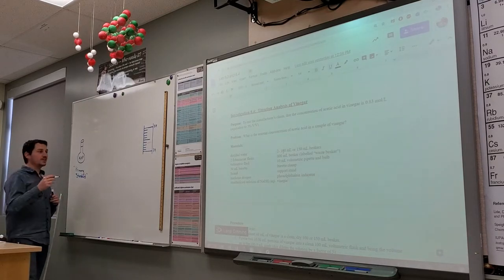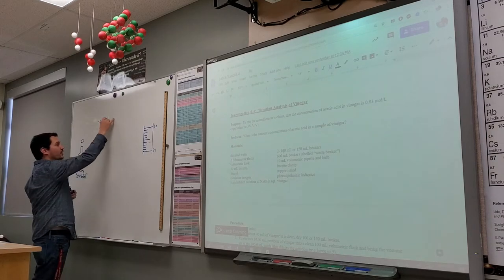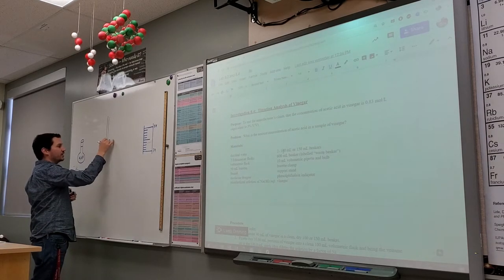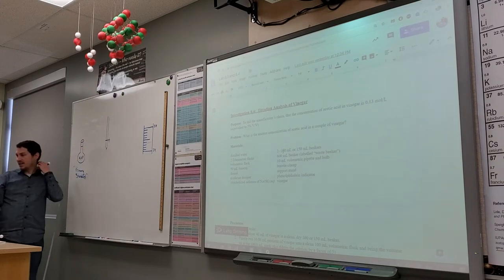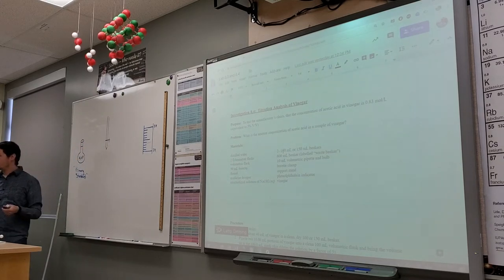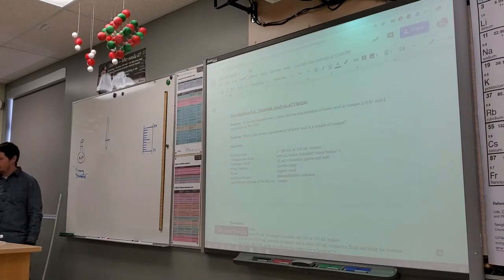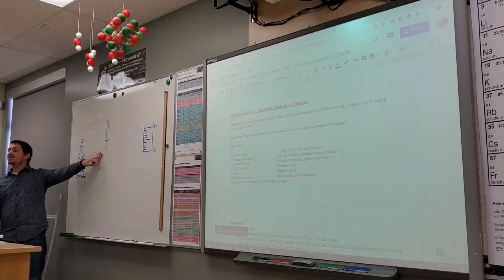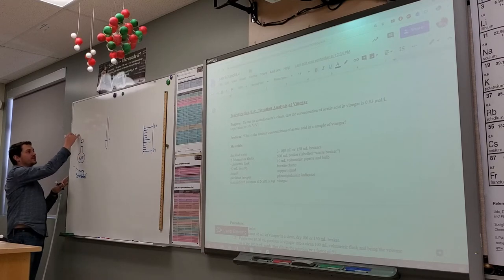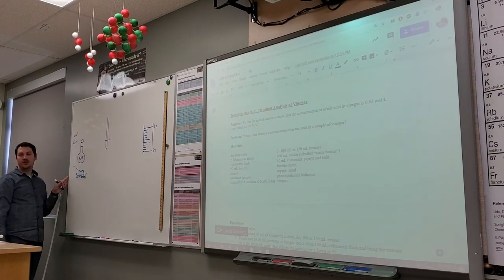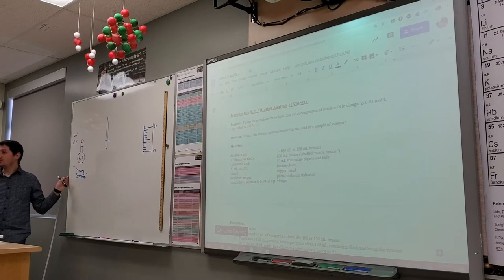We used our titrant and we titrated our primary standard yesterday. We used our titrant to titrate our primary standard because we knew this volume and this concentration really well to a very high degree of accuracy.